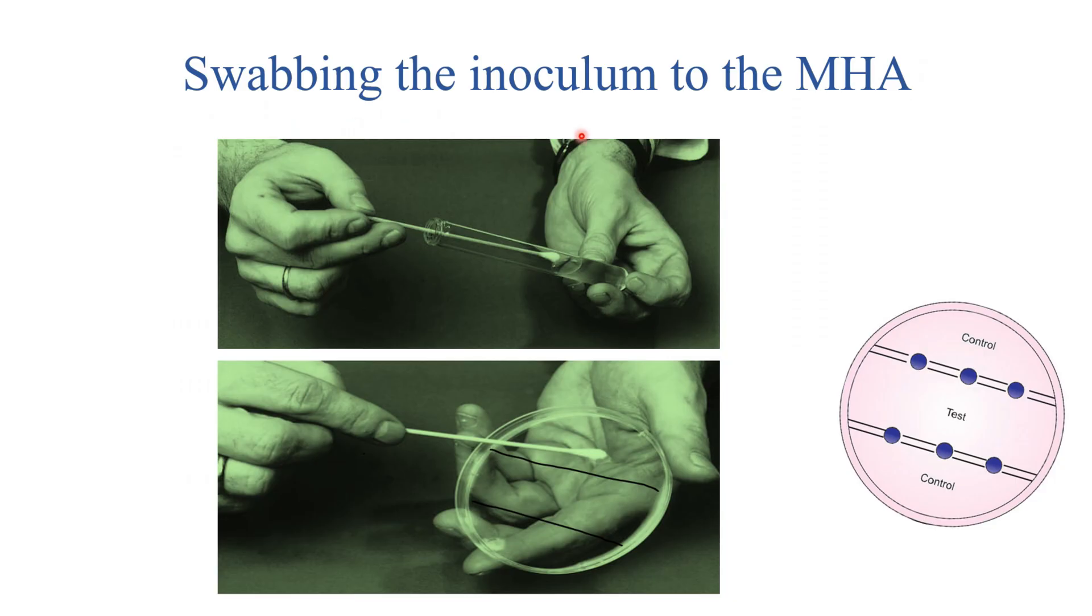Swabbing the inoculum to Muller-Hinton agar. After checking the 0.5 McFarland standard, we will make three parts in the Muller-Hinton agar in the case of Stokes culture method. First and the third part is control. Here you can see this picture and the center part is called the test and we will lawn culture the control strain into the first and third part.